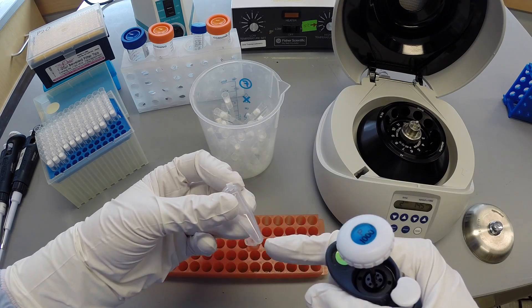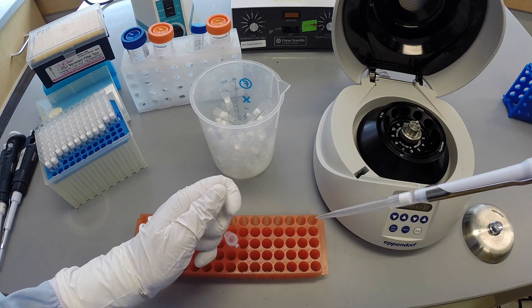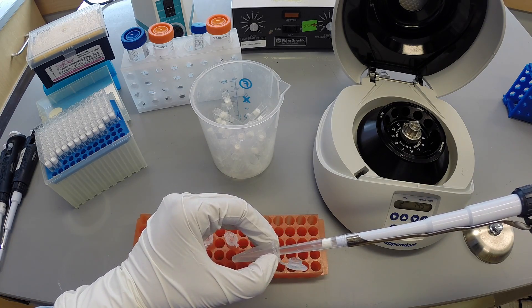Visually inspect the tube to see if the pellet is still present. If it has gone missing, make a note of that.